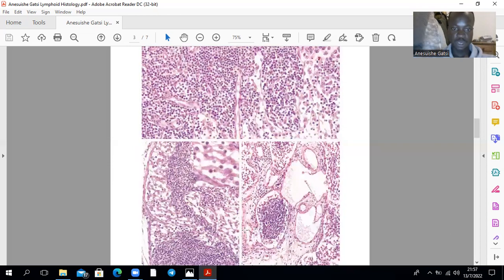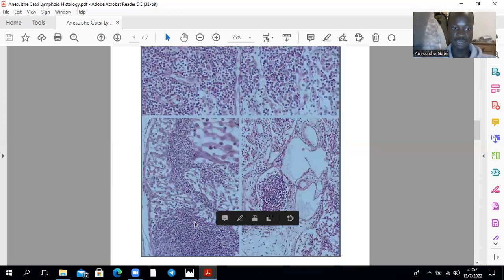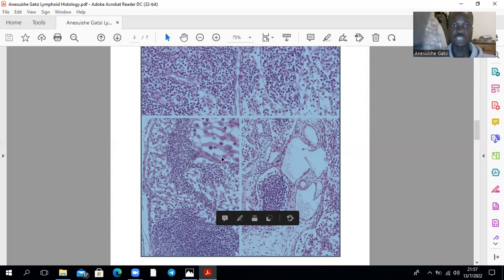And this one — that's a lymphoid nodule. Those are reticular cells, quite hard to distinguish from fibroblasts.